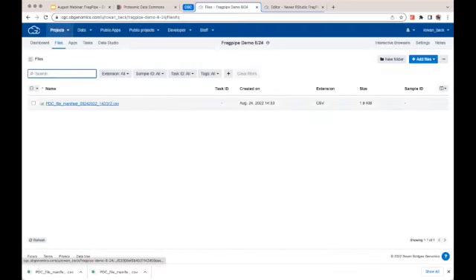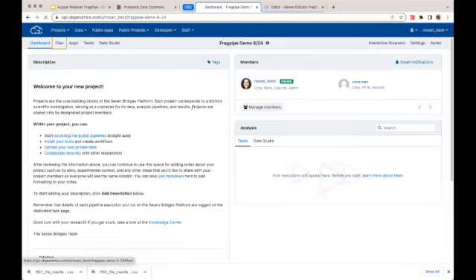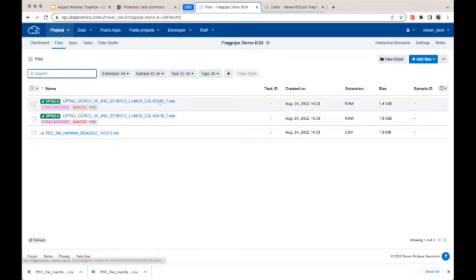So you'll see the actual CSV file here has been uploaded. I'm going to click back to my dashboard and then files. And now you'll see that the files from the PDC have populated in our project.